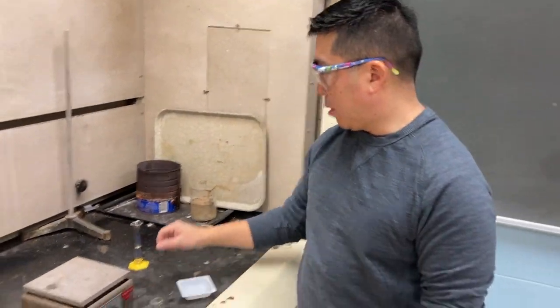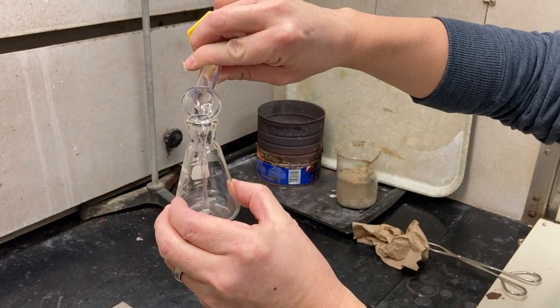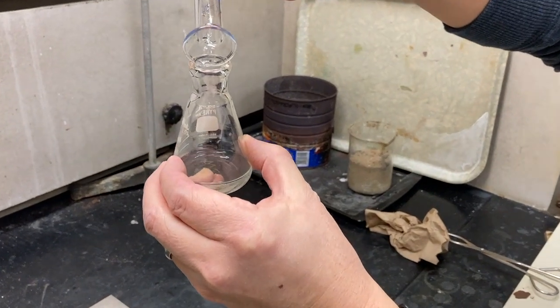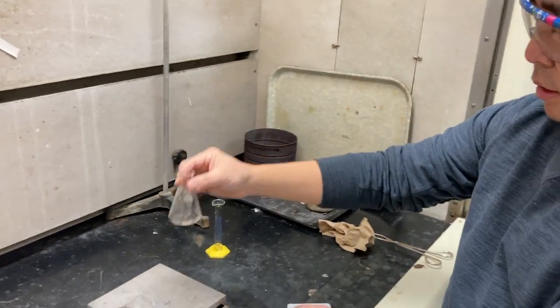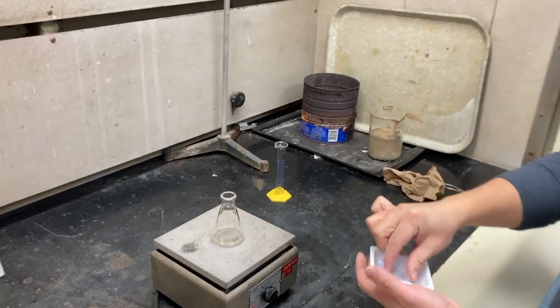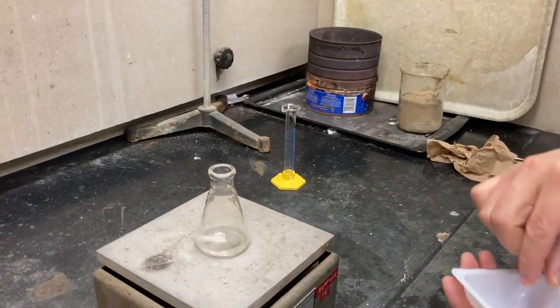So I'm going to start by adding the hydrochloric acid. Now the lab calls for about 6 milliliters. Right. Around 6 is fine. Nothing's happening. It's because it's not reacting with anything yet. Okay, so I'm going to put that on the hot plate, and I'm going to add the metal pieces. Be careful. The reaction should be pretty evident almost immediately.